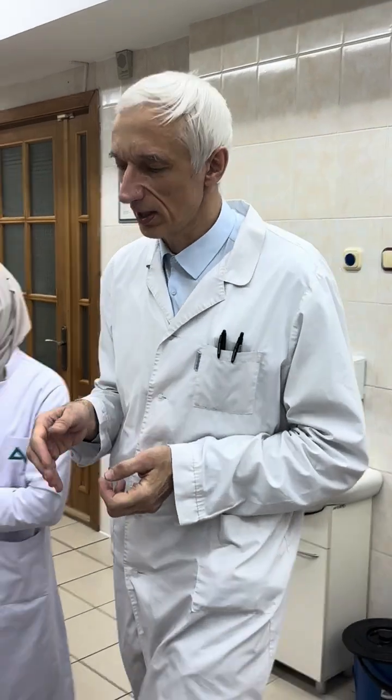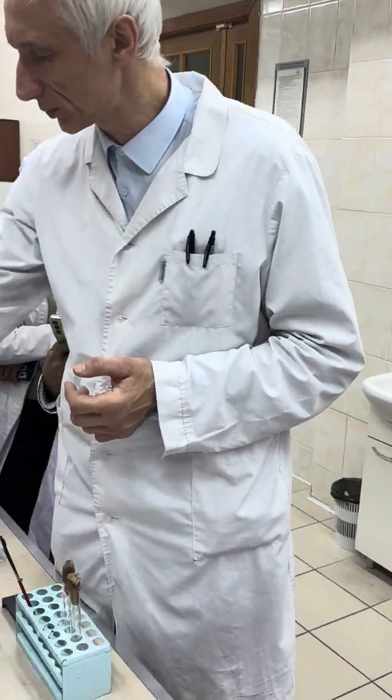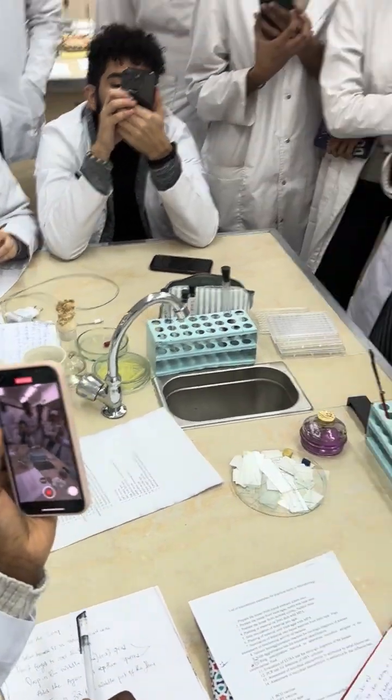Moreover, sometimes it's very difficult to find something in your slides. We are sometimes testing first generation software when we try to make everything from the beginning to the end. So, people, after finishing the slide, we will have some theoretical discussion about microscopy, and the slide finally should be discarded, like any such infectious waste, into disinfection solution. You should remember.